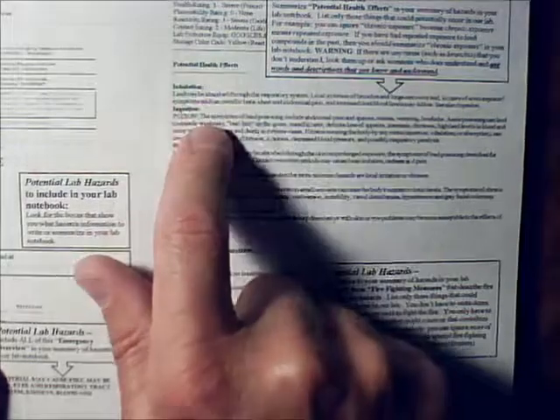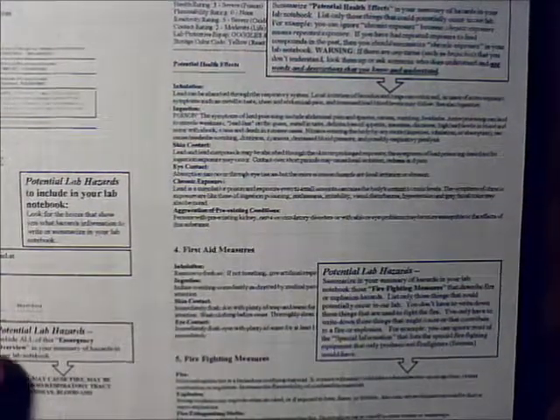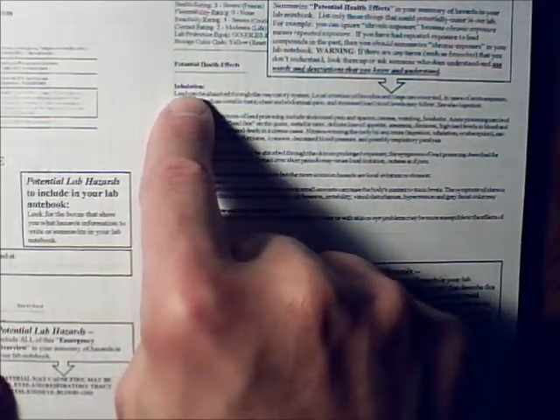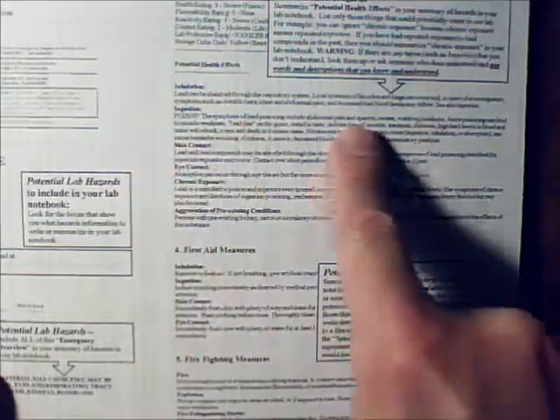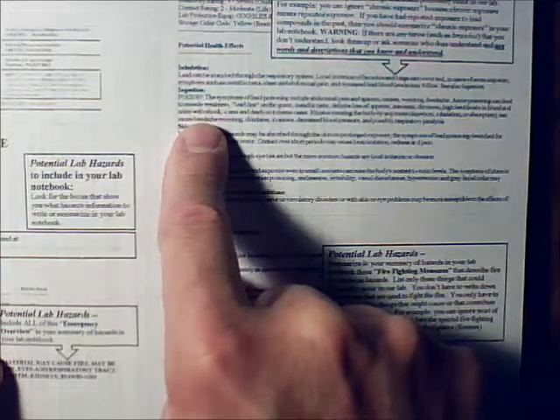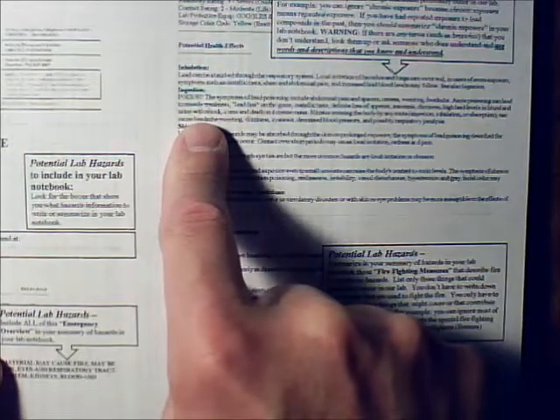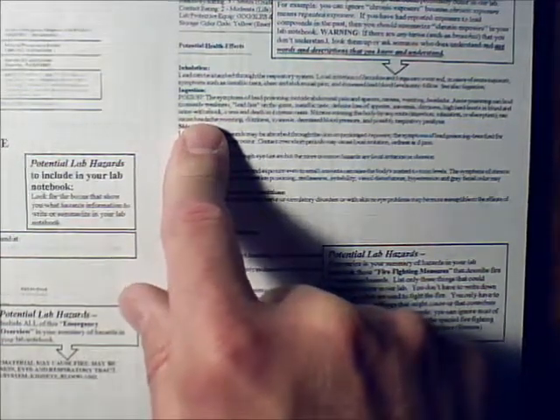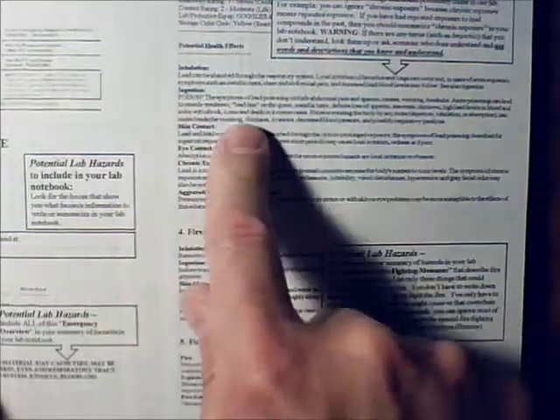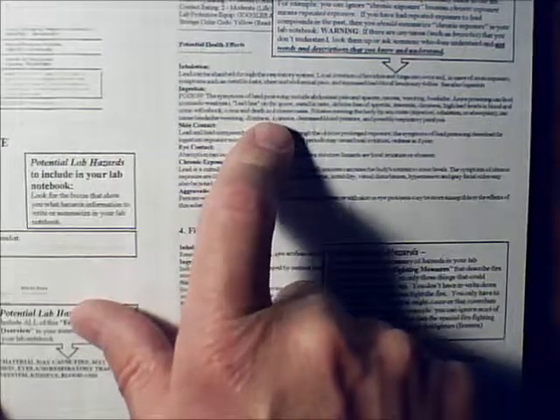Now, over here under something called potential health effects, most of those can happen to you in a lab. If you're working with a chemical that's a dry powder of some kind, you could possibly breathe it in. So you want to summarize what those hazards are here. You could ingest it. It's possible. You get it on your fingers, you lick your fingers. Hopefully you don't. It would taste awful if you did, but you don't do it. But this is what happens if you do. Summarize those.